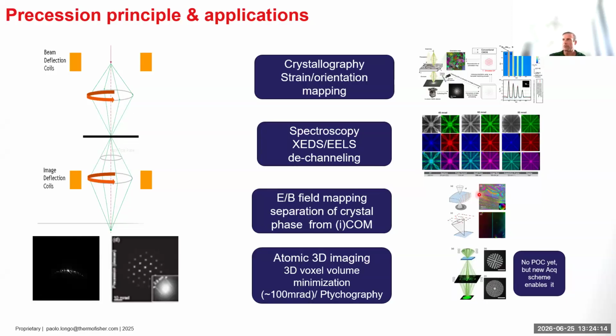This is very important for crystallography. You can dramatically improve quantitatively your strain orientation mapping. You can improve spectroscopy in the case of crystals.